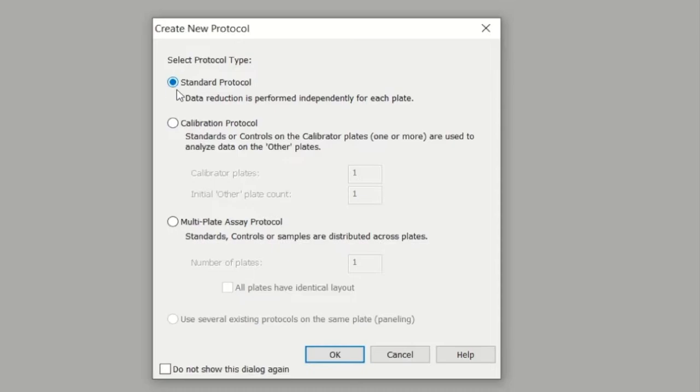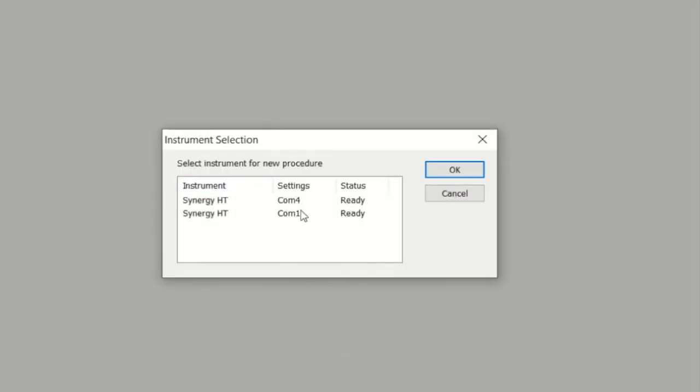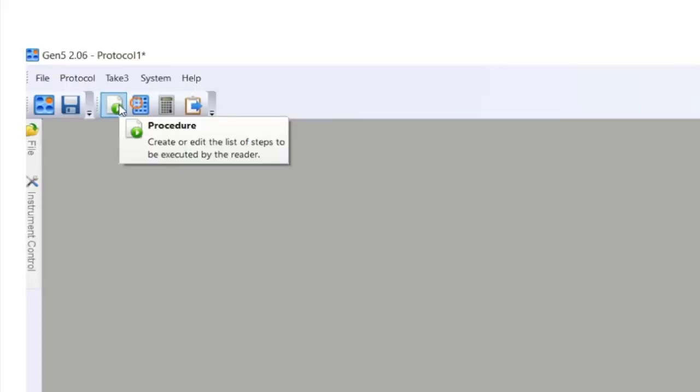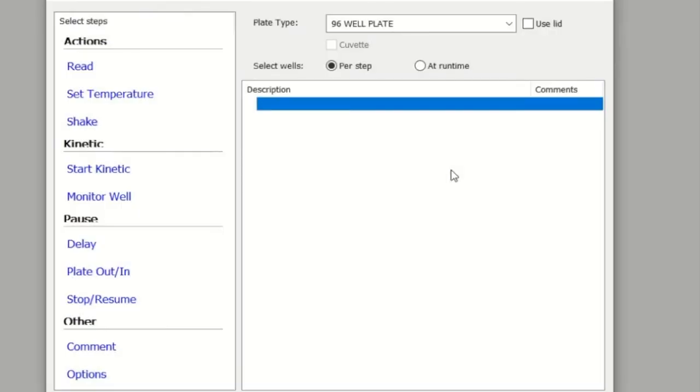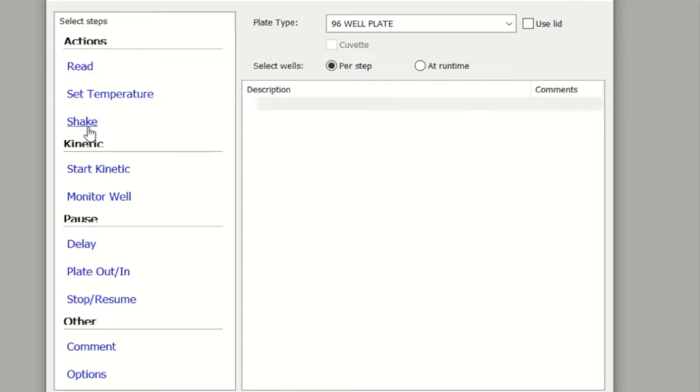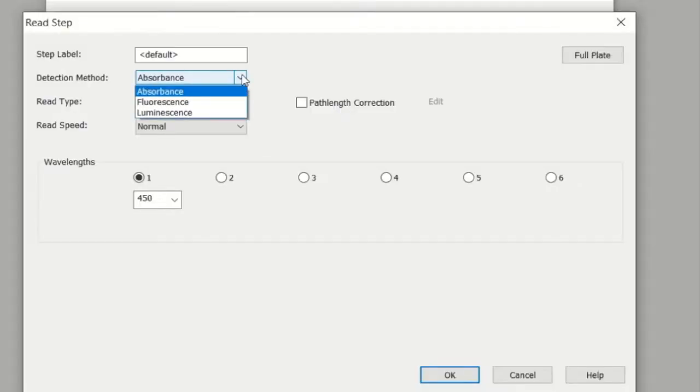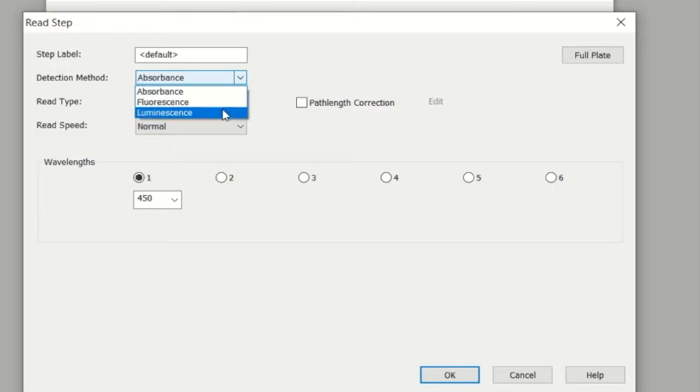You get the interface where you've got the option of going to Procedure. Here you create or edit the list of steps that you want the program to execute when reading. I'm going to go ahead and choose Read and let it know what sort of read we're doing. Are we doing absorbance, fluorescence, or luminescence?